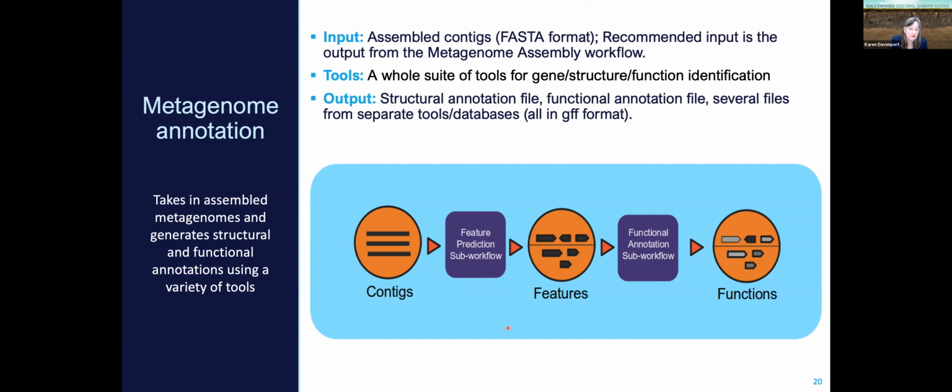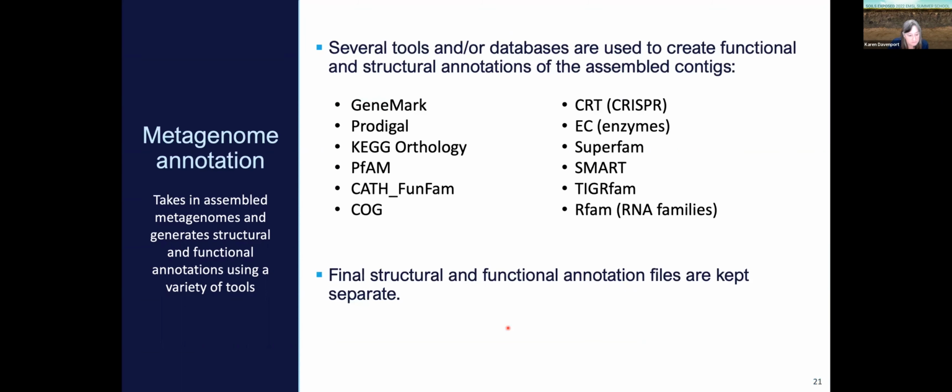And these are in tabular form as either TSV or in GFF format. So these are all of the different tools, I believe, that are used in the NMDC annotation pipeline. And the final structural and functional annotation files are kept separate, but we're combining all of the output from these to create these final files.